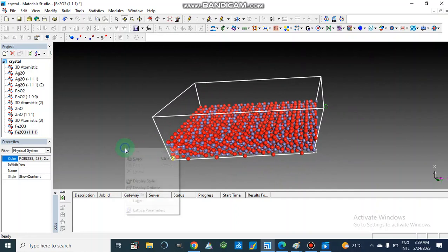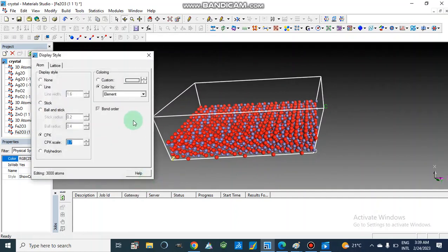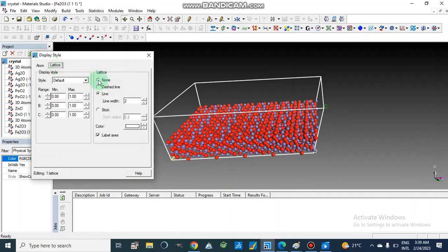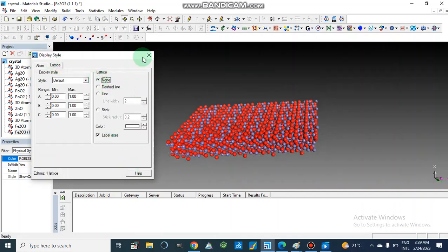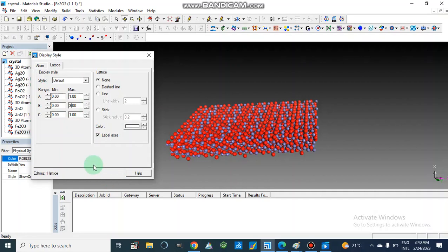I am going to remove these lines — go to Lattice. We can build the lattice towards any direction. Here if I am going to make it as 3, it will be built in the B direction.